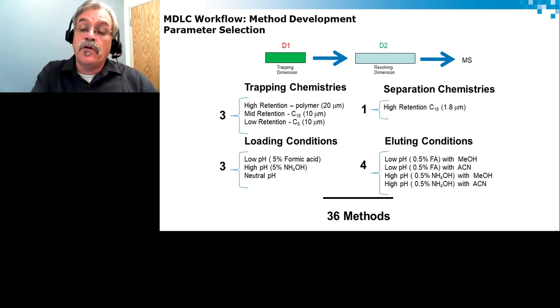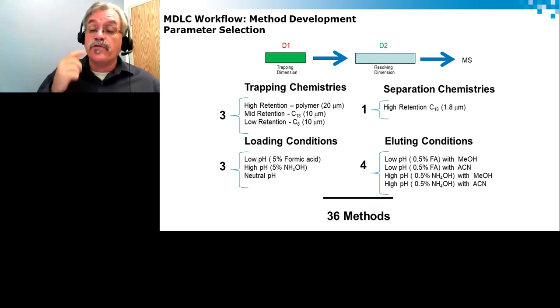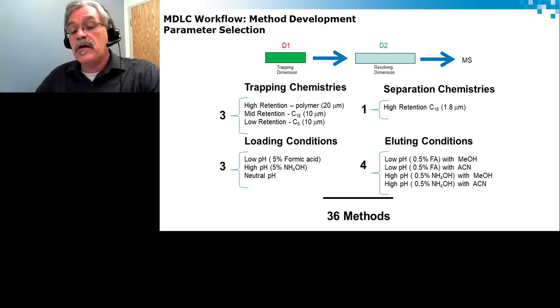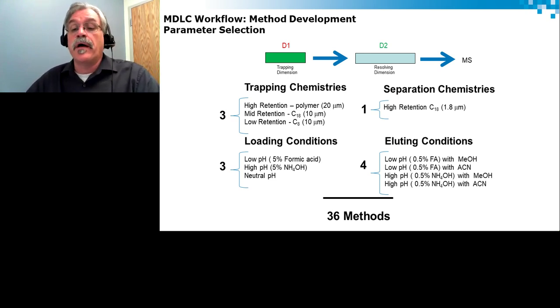It becomes very difficult to find several target analytes that behave exactly the same. That's where multi-residue comes in.